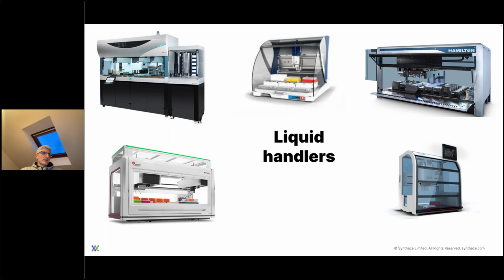And so they're basically mimicking what we'd do with a handheld pipette, but they can do it without any worries about how complex or difficult the protocol might be. And so there's obviously a real advantage there when we're trying to run a highly complex design of experiments.